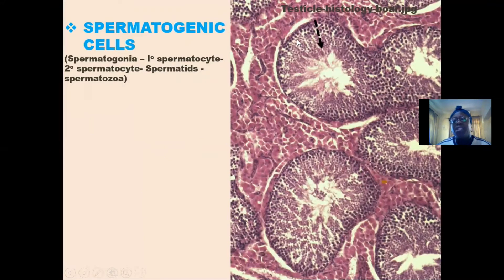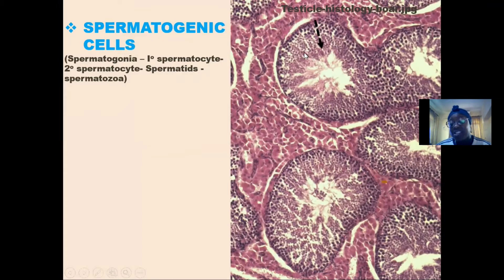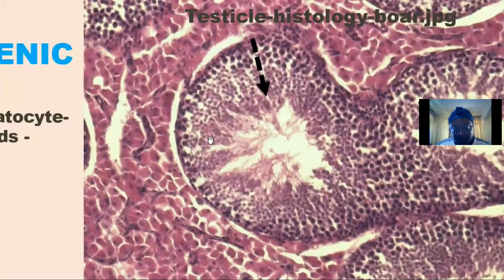Then the spermatogonia will further develop into primary spermatocyte. From there, we have the secondary spermatocyte, which finally becomes the spermatid. These spermatids are seen like a thread-like presentation just close to the lumen of the seminiferous tubules. If we zoom through it, we'll see how the spermatids look like — this thread-like configuration just close to the central lumen of the seminiferous tubules.